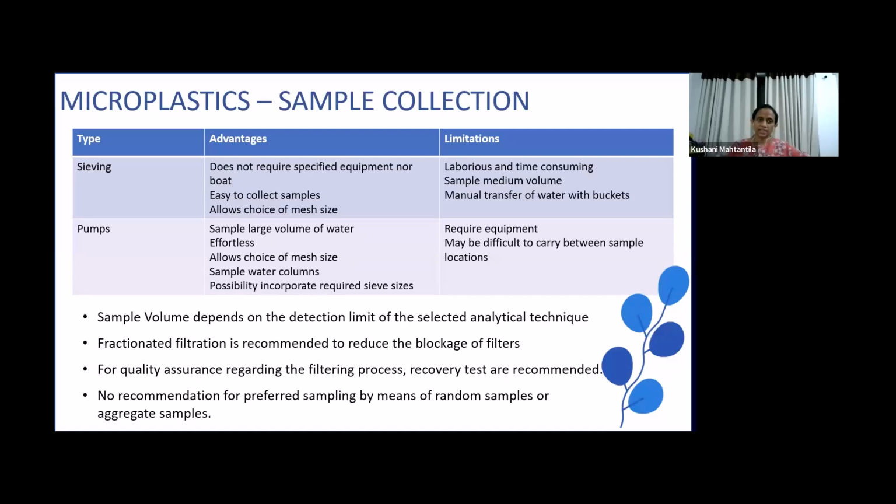Other than the nets, sieving and pumps are available. The advantage of sieving is that it does not require specific equipment or a boat. We can use a cascade of sieves to collect the samples, and it allows choices of mesh sizes. I will talk about the mesh sizes in the next slide. But this is laborious and time consuming.